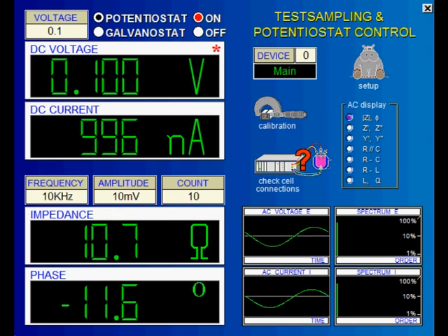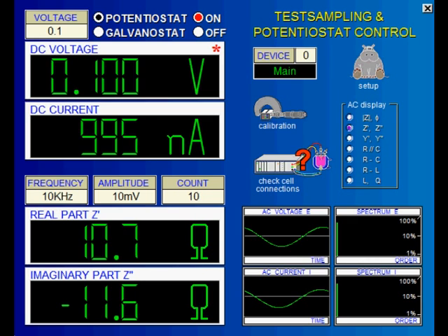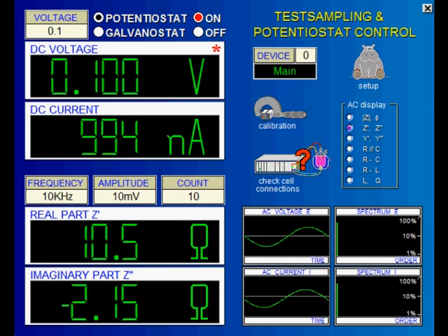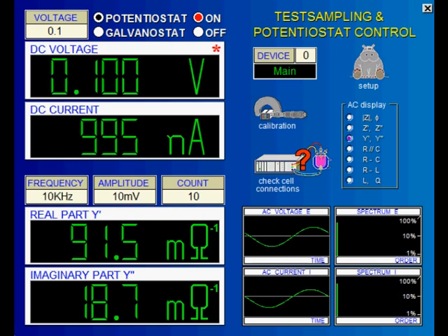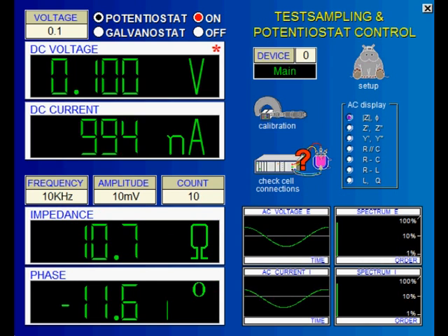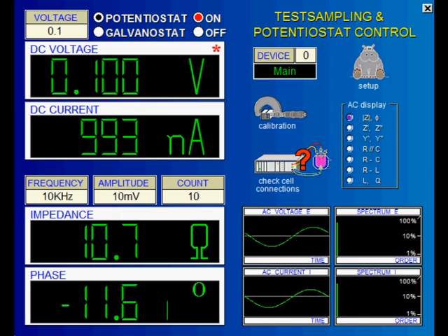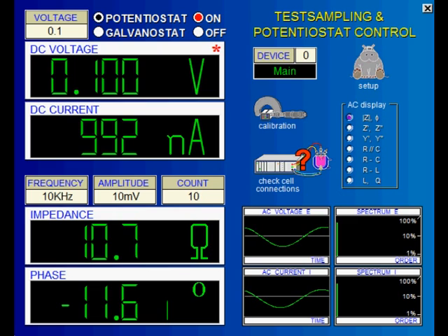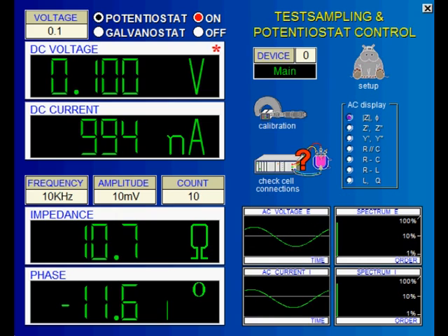The display can be adapted to your needs by selecting your desired output format. This setting is also valid only in the control potentiostat page. These four displays show current and potential of the AC signals in the time and frequency domain. You can easily see disturbances, noise, and harmonics here, and with this information you have a first estimation of the quality of your measurement.